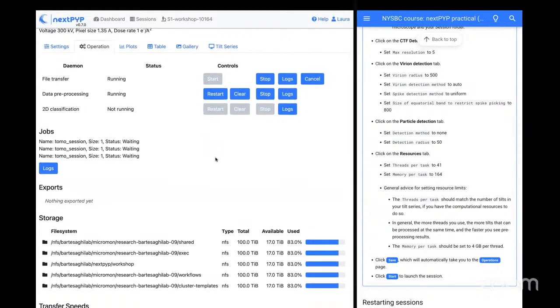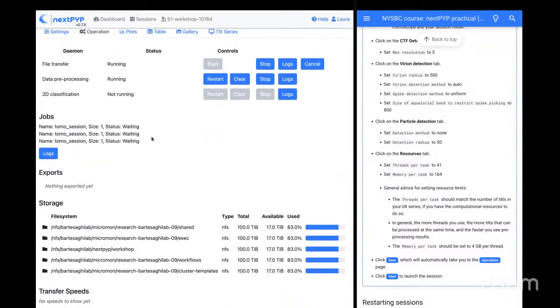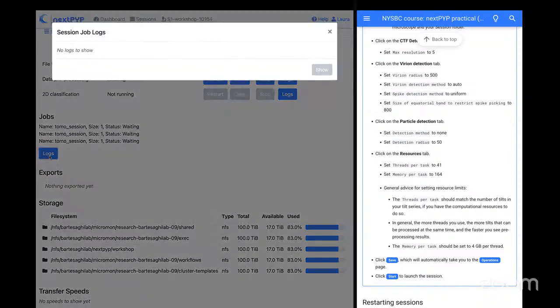Now all 123 images have transferred over, so the last bundle of 41 images is here as well. So we've launched the preprocessing job for that as well. I wonder why it's waiting. Are you able to check?